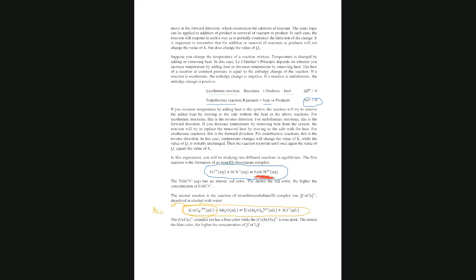This is actually the picture that I sent you when I sent the email inviting you to this workshop. The picture down is showing 2 different test tubes. Okay, this reaction. So when the cobalt chloride 4 -2 is in alcohol, it's going to be blue.